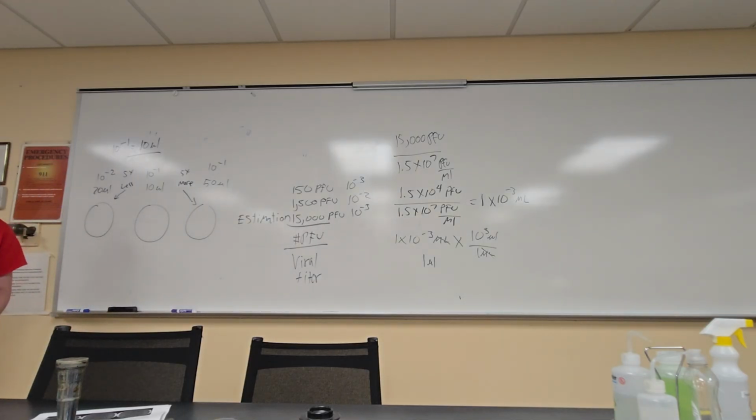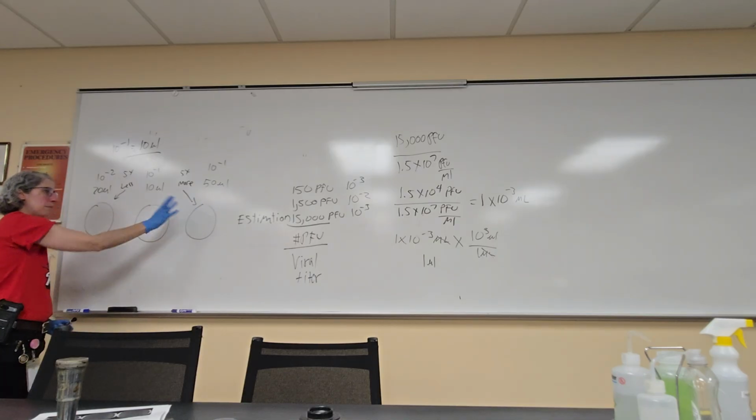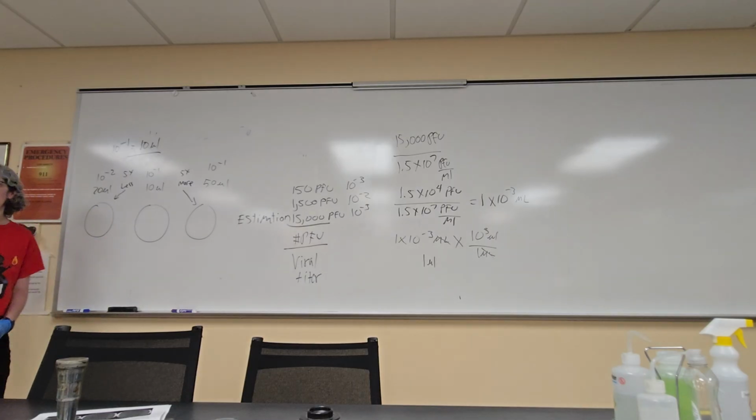Okay? And then you do your usual plaque assay, leave your plates there, and hopefully you'll have a nice webbed plate here. Hopefully this will still be webbed and not totally blown out, right? And this one might also still be a webbed plate, right? But the point is that we'll have a lot of virus either way, and hopefully you'll be able to collect those lysates and do your titers again.